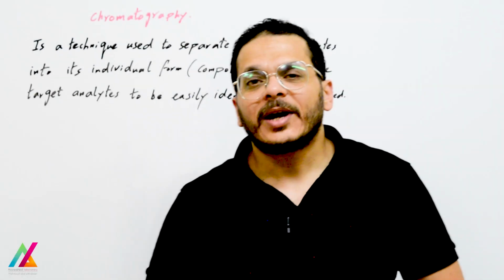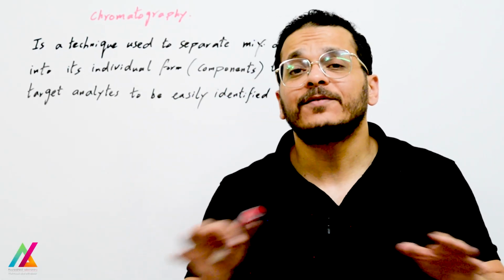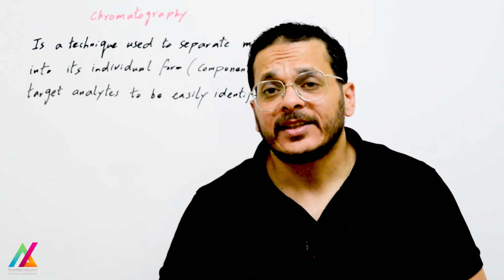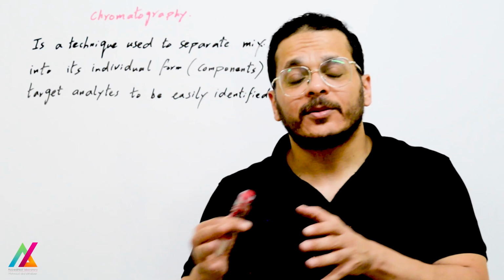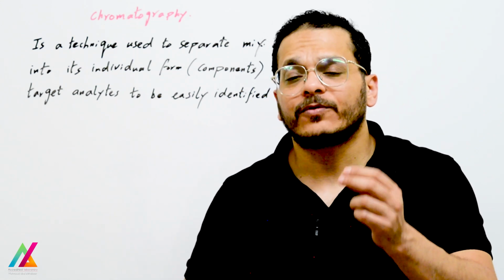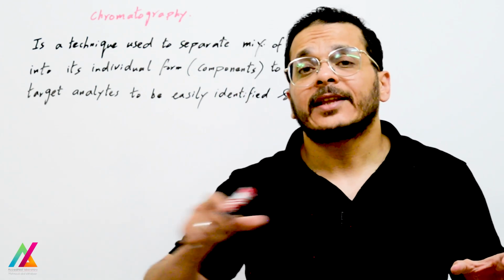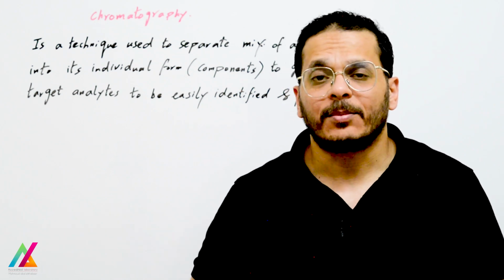Hey everybody, welcome back with a new training course about one of the most important techniques in every lab, chromatography, which plays a very important and vital role in many fields, from chemistry and biology to pharmaceuticals and environmental science. And it's a powerful technique which allows us to separate, identify and quantify complex mixtures of compounds in the sample.